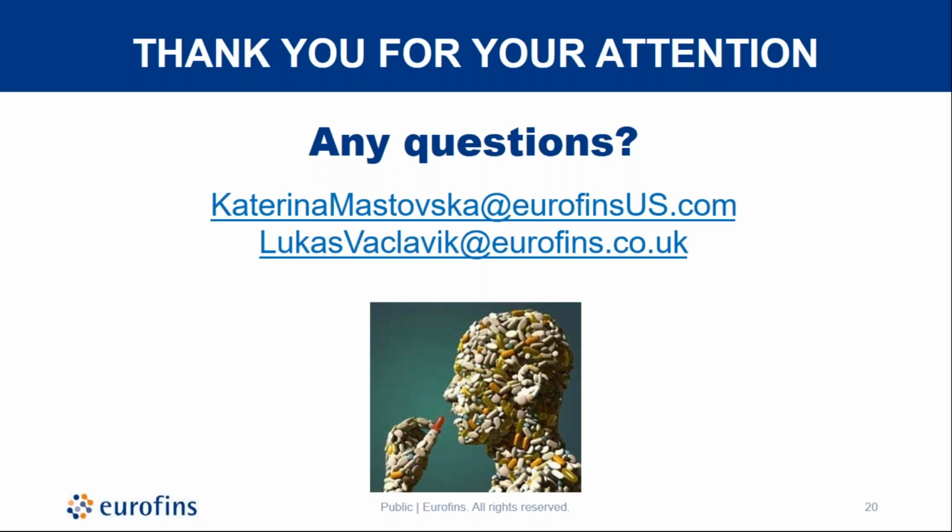This method has been used mainly for study work, but it's fully applicable to dietary supplements as well. Just to note, in this case, we are not using immunoaffinity column cleanup because we don't have columns that would accommodate 40 plus mycotoxins, but the method works, and we are able to monitor those compounds and quantify as well.